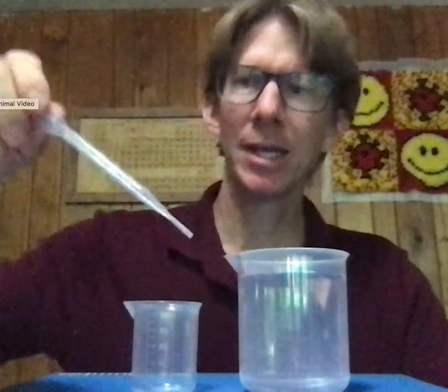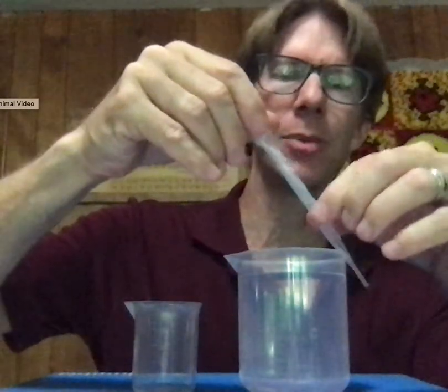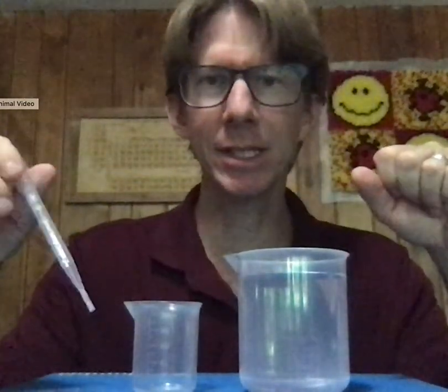This is experiment one, basic techniques. Deliver 2.0 milliliters with the plastic pipette. I've got my plastic pipette, my previously weighed beaker, and my water that has equilibrated. My pipette has been conditioned with the distilled water, so that I know that only distilled water is in here.